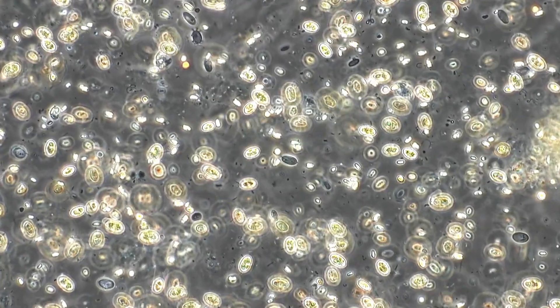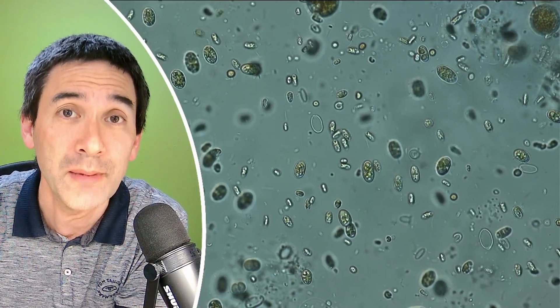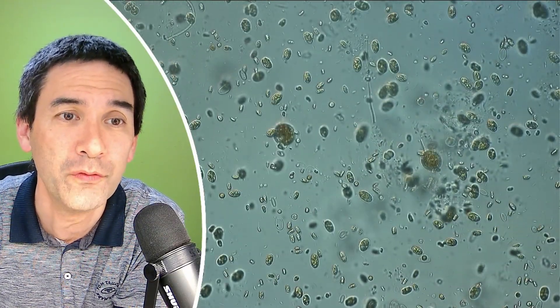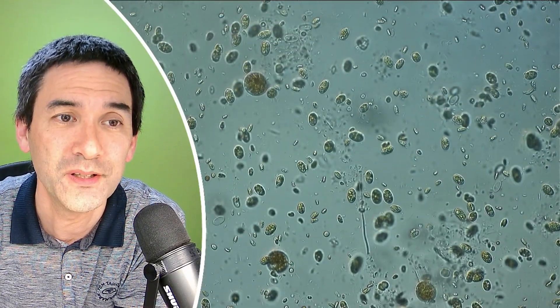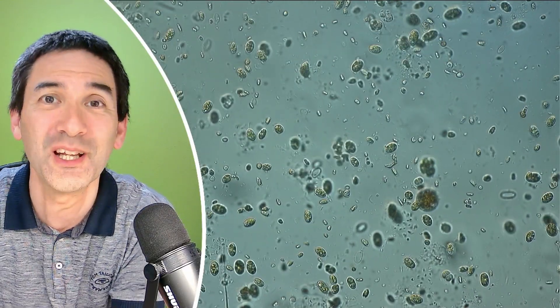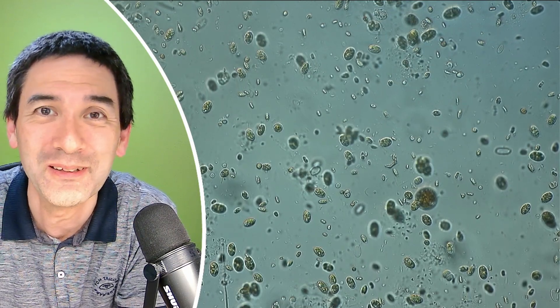We're now looking at it using my 60x objective. Let's go down a little bit with the magnification — this is now 40 times. And here we have a slightly better overview of the different cells that are present. So essentially many of them are celebrating a party here.